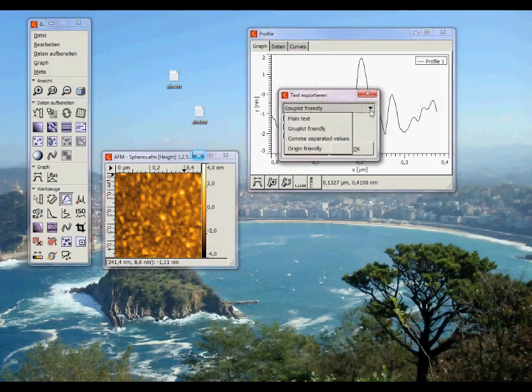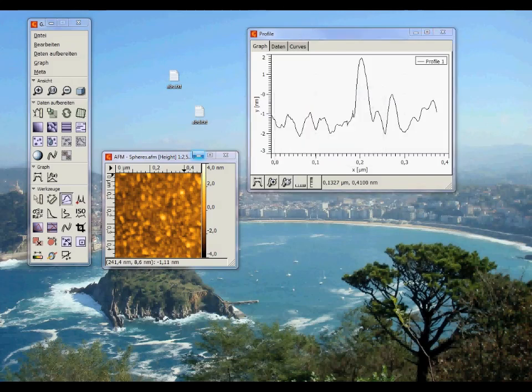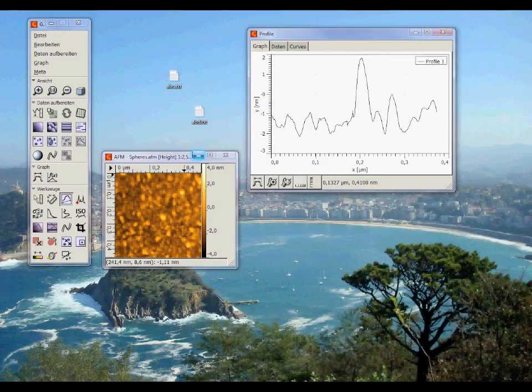Exporting as comma-separated values is my favorite, since the values are separated by semicolons, as in this file here.